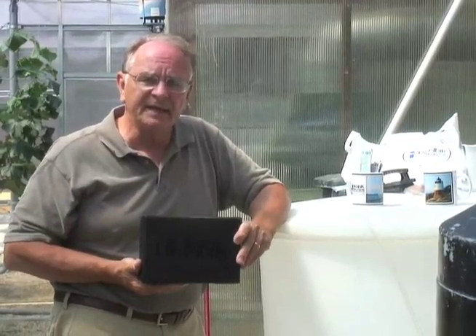Easy calibration, easy use, big numbers. Ideal for hydroponic growers such as American Hydroponics.